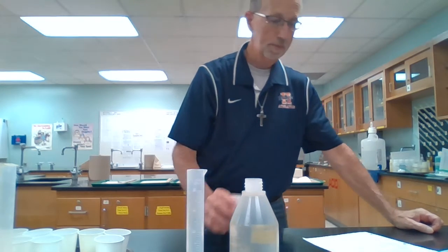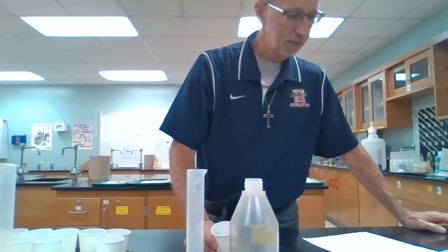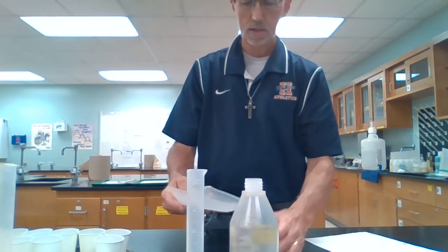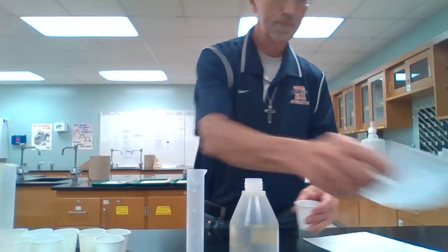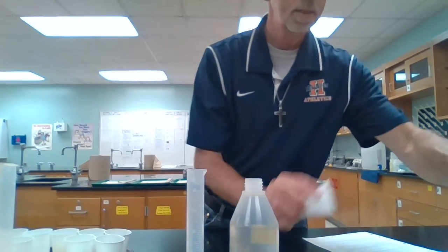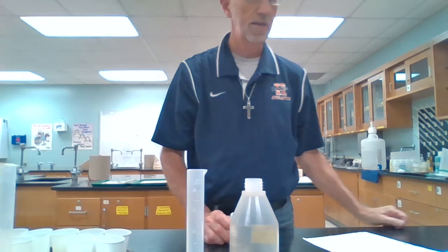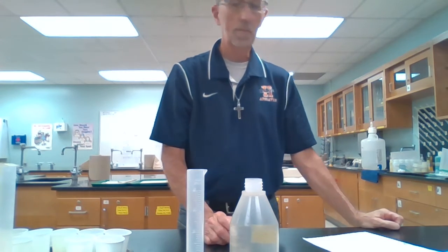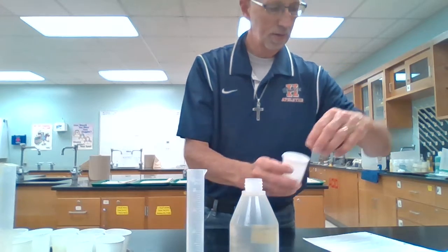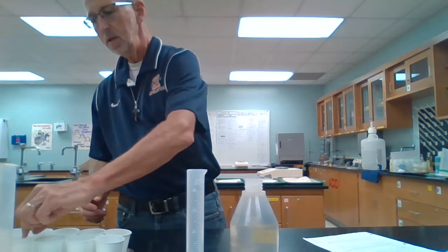No, actually not little pieces. They're somewhat large. 32.31 grams, 32.31. Zinc number 3, got some bars again, irregularly shaped though. 34.61 grams for number 3 for zinc, 34.61.